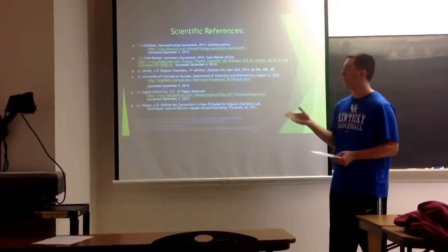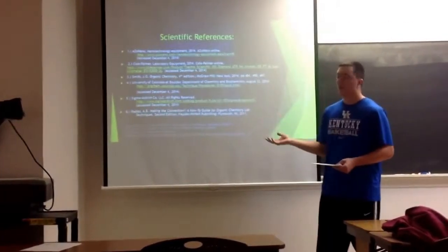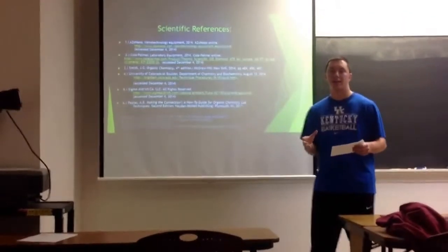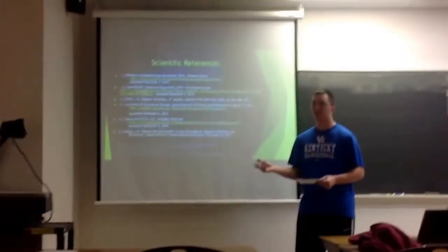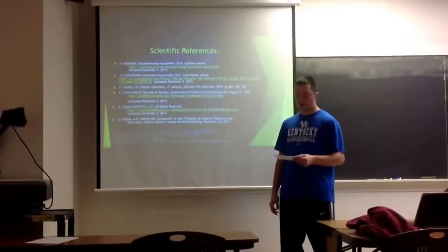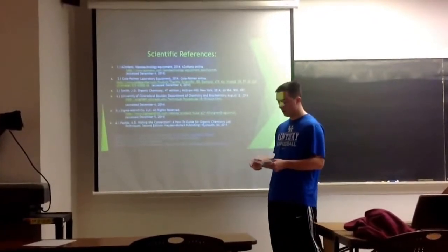It was better, but I still think it possibly could have been better, even though we ran an extra 48 scans on it. So if I were to do this experiment again, I would definitely monitor that attachment more and make sure that I could get it as perfect as I could get it. Another mistake, I think it's just precautionary, is we could run more scans on each product or sample that we evaluated, just simply to get more defined peaks that were easier to possibly read.